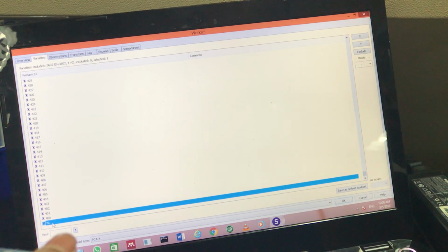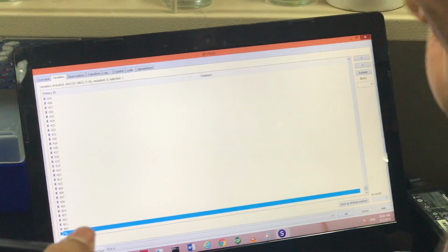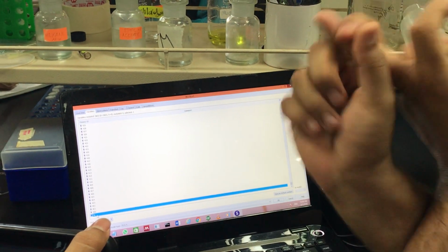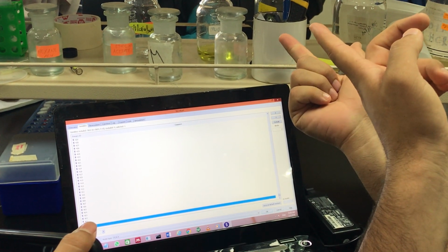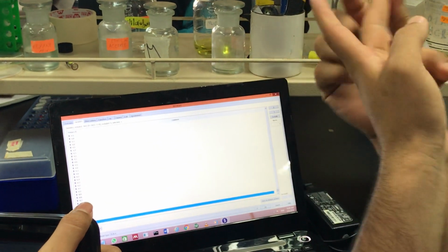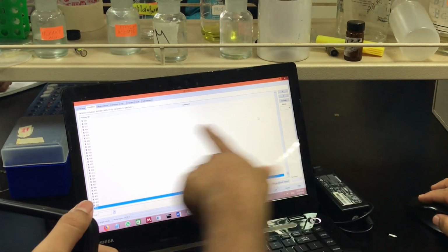Usually the variables, the FTIR or GC-FTIR result or GC-MS result or NMR result, will be assigned as X. There are two, X and Y. For our data, we use X. For the result, like the inhibition, the biological activity will be Y. X and Y. You can see here all X.